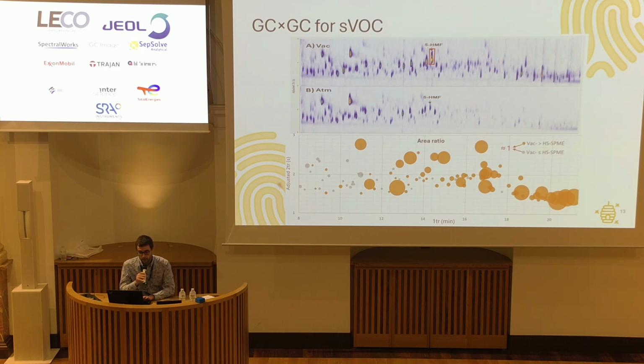We have here a first part on the early eluting compounds, the early eluting part of the chromatogram, where vacuum doesn't have a great impact, and this is something that is already known, since vacuum is accelerating the extraction of the compounds. If the compound is already volatile enough, that won't change the quantity that we will extract.